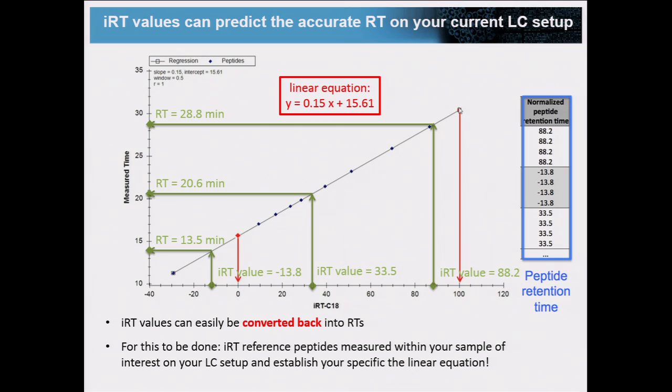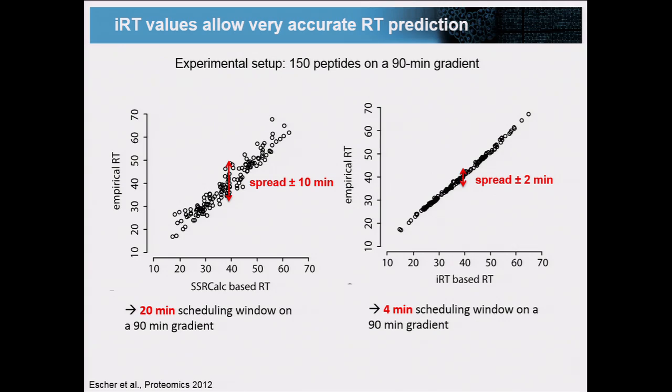In Skyline, as was asked, all this concept is implemented, but there are two steps that we need to implement. One is the way that we go in this direction, so how we calculate IRTs, that would be a calculator. And then in the second direction, when we have a calculator, how do we predict retention times? You'll see this in the tutorial. But what we know is that empirically these predictions are pretty good.